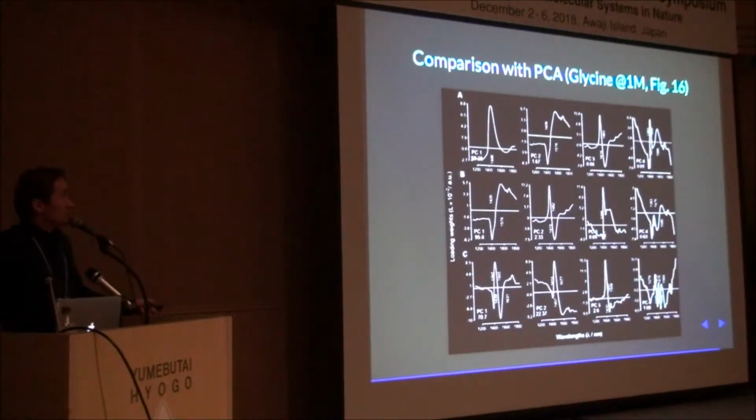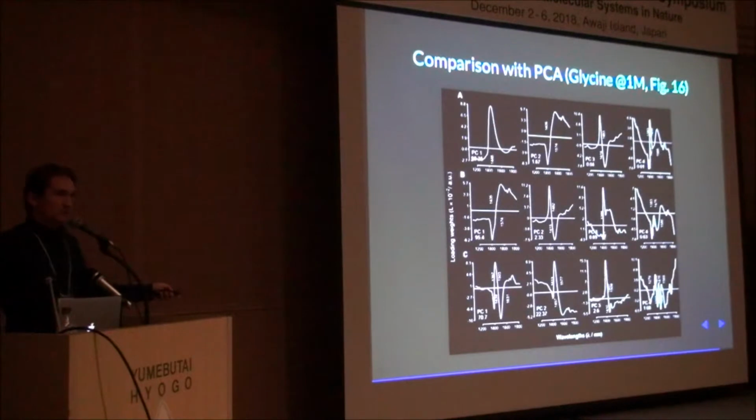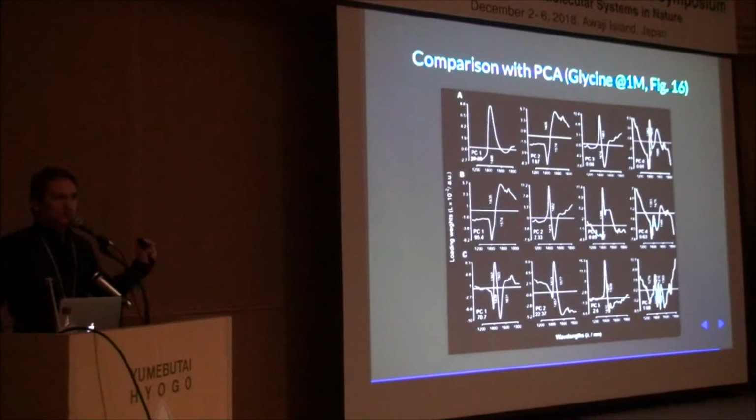Okay, finally, we're going to compare this to the effect of subtraction on PCA analysis. I'm making this point using 3 rows of data. This is a PCA of raw spectra. As you know, with PCA, the first component is always going to be the average spectrum of the data you're supplying. So here we have supplied raw spectra. In the middle row, we have supplied spectra that have been subtracted in a classical way using a single average spectrum. And in the bottom row, the spectra we put into PCA were subtracted by optimizing the molecule, the closest molecule.